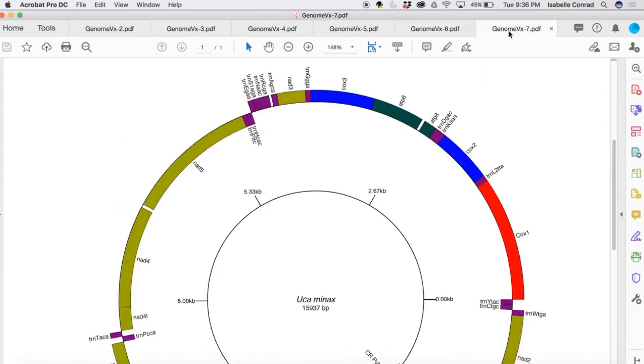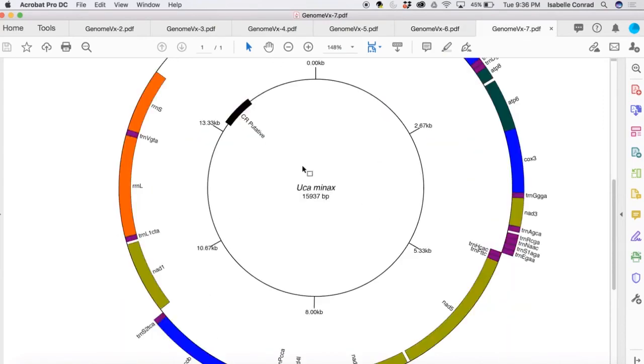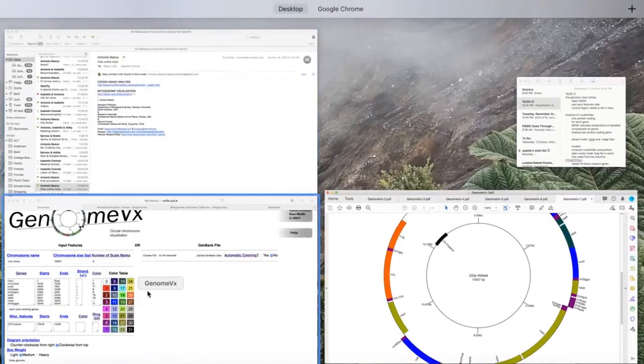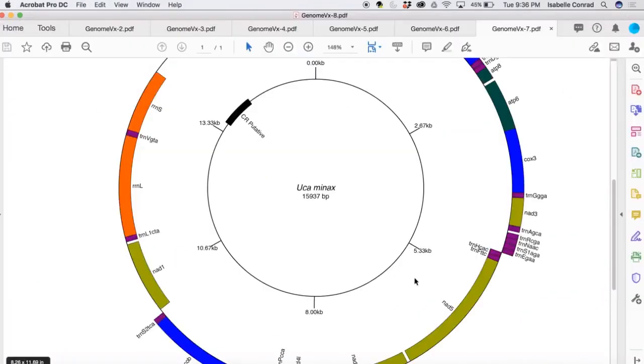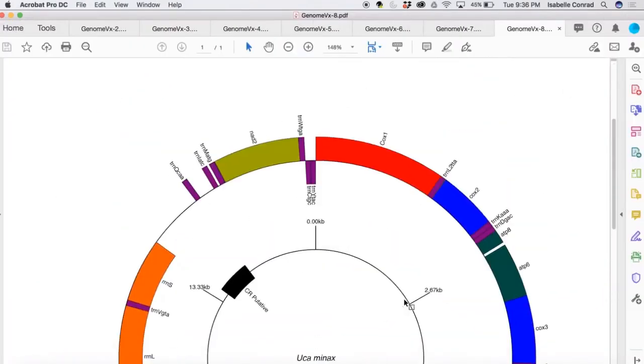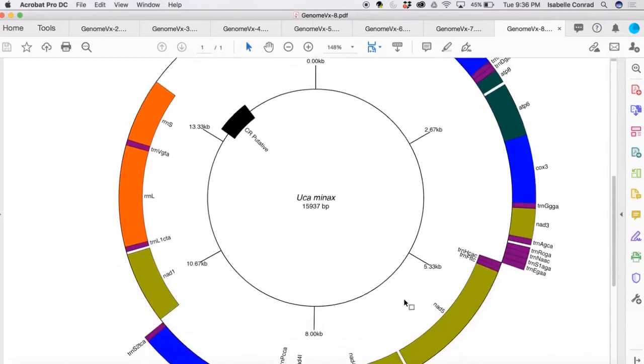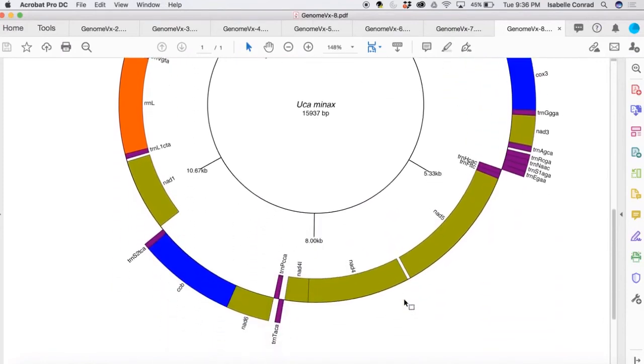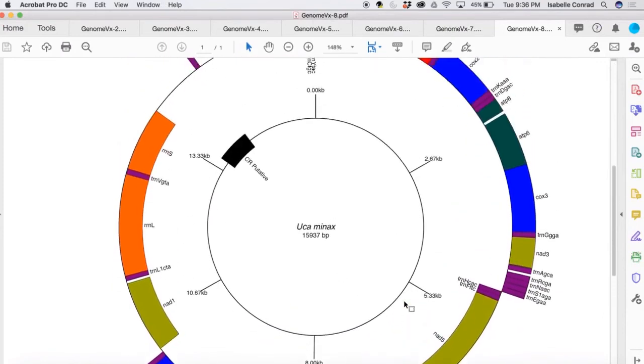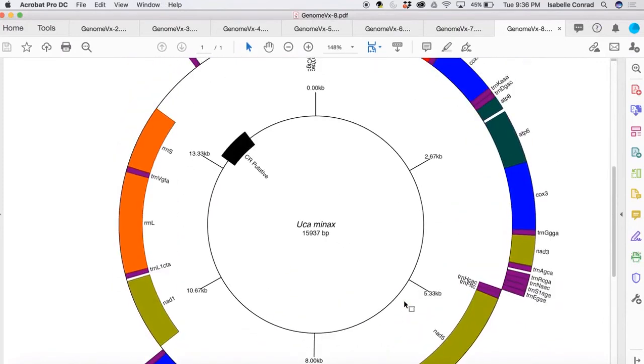You can also, as I had mentioned before, go change the box weight. We've already done medium. So this is what heavy looks like. It just makes it a little bit thicker. Or we could do light.